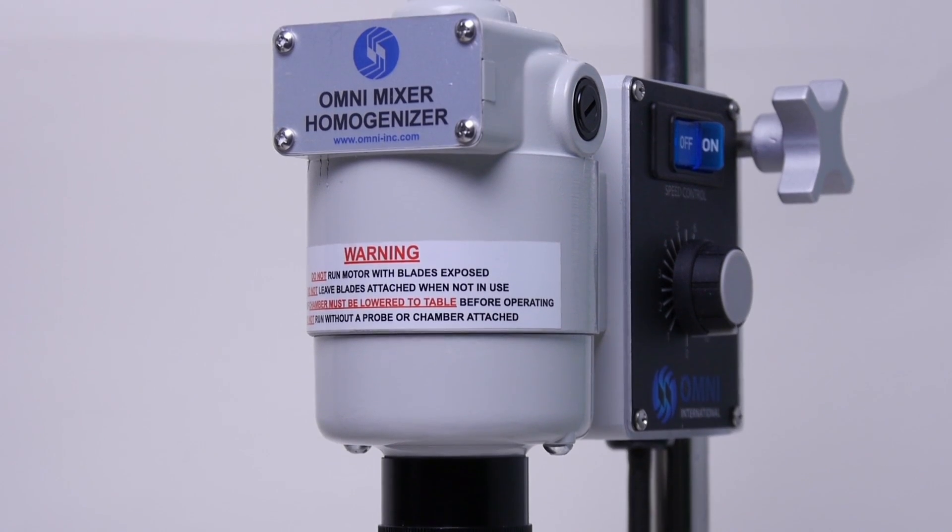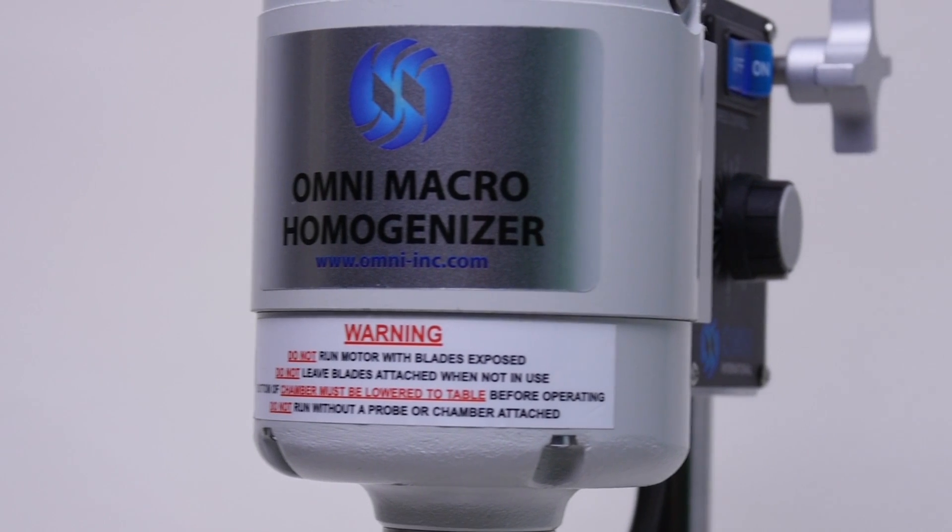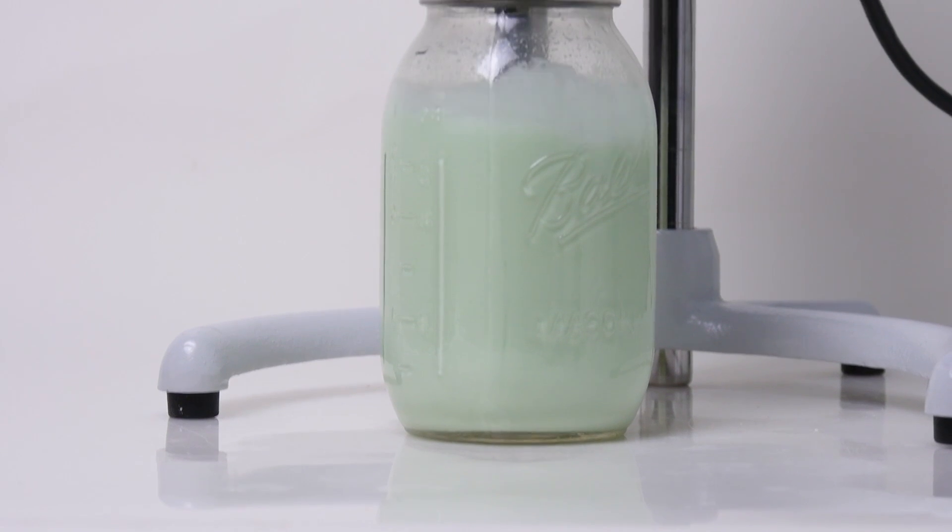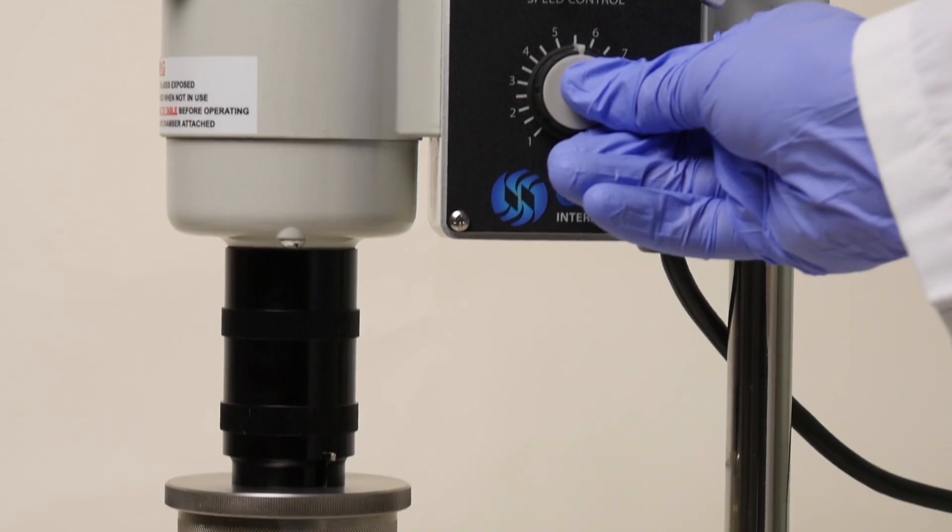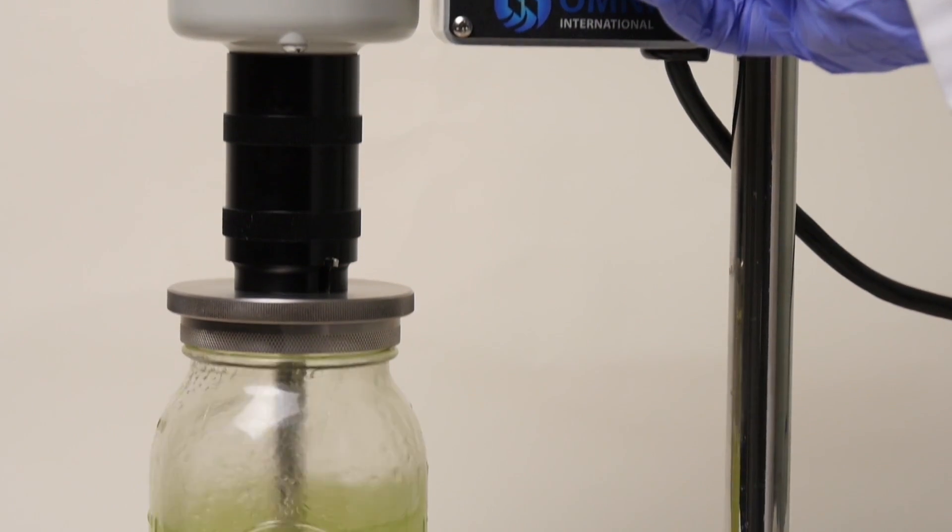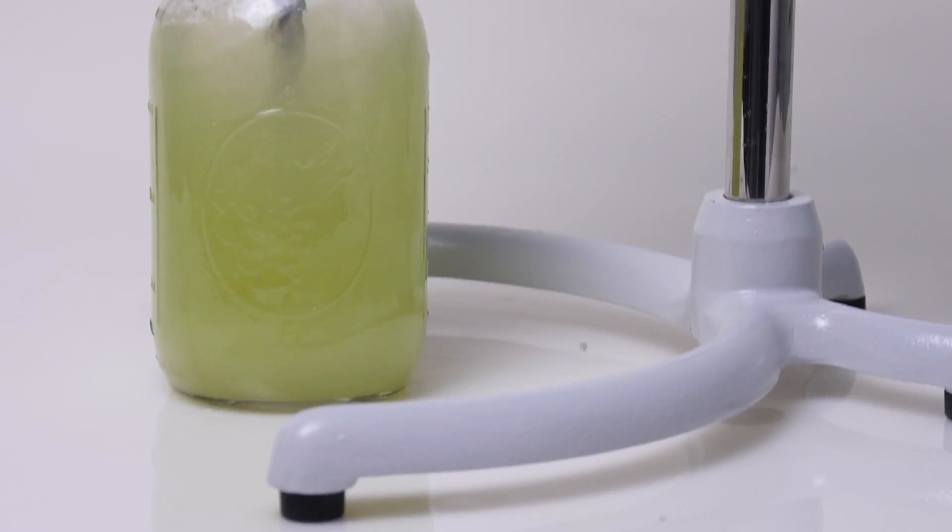The 600W Omni Mixer and 1800W Omni Macro reliably homogenize, emulsify, disperse, blend, and mix a wide range of both organic and inorganic sample materials.